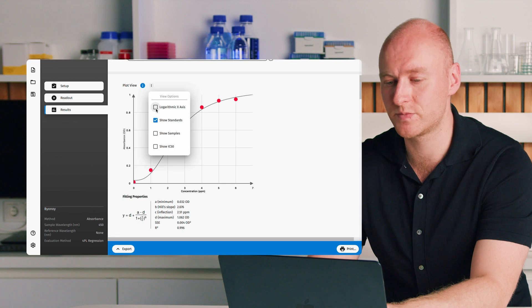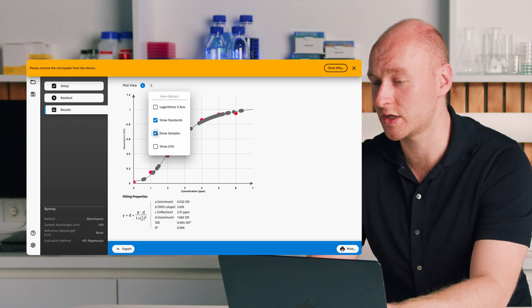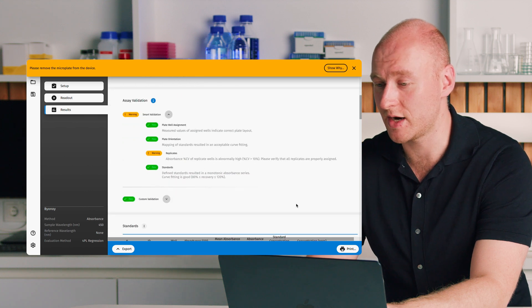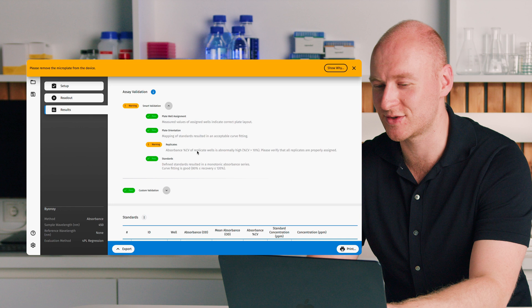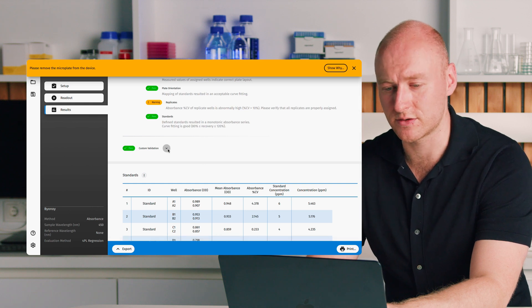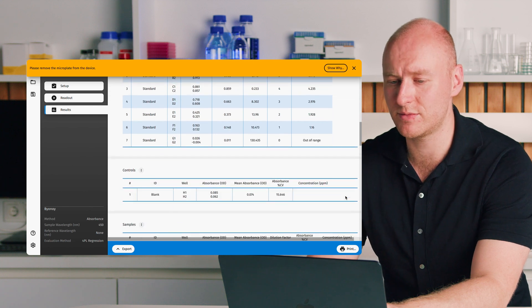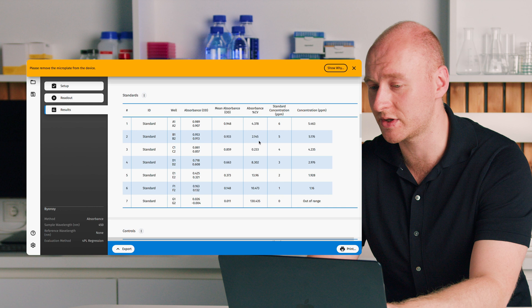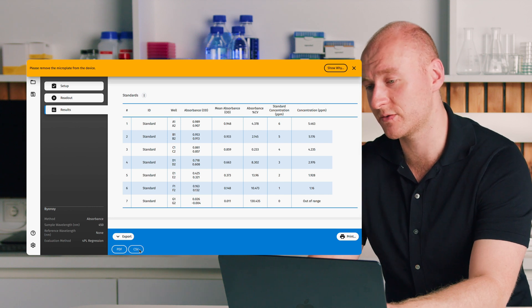In the software we have a plate overview, then our plot view showing the standard curve we plotted. You can show the x-axis logarithmically and show where your samples fall on the standard curve. We also have fitting properties and assay validation results. Most validations passed successfully, though we're getting a warning about our replicates — possibly due to pipetting errors or a forgotten dilution. Our custom validation was successful: all blanks are less than 0.2 OD. We then have a tabular overview of standards, controls, and samples showing mean values and percent CVs. This data can be exported as a PDF report or CSV file importable into Excel.